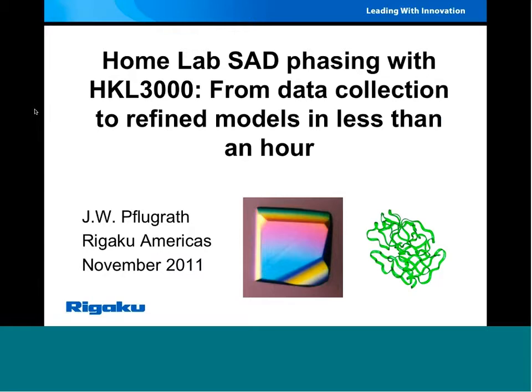Great. Thanks a lot, Angela, and thanks everybody for stopping by to watch this webinar. It's an unusual one for me because I'm talking about something that I use, but I actually haven't really contributed to the software for this. As we go along, I'll try to show 3 examples. This should also be useful to all of you past today, because if you have to teach somebody in your group or your lab how to use HKL to process data or to do phasing and display models, then you can just say, well, go to the Rigaku webinar and watch this, and that will save you a lot of grief, because they can watch this first, and then they can ask you questions, and you can explain things to them.